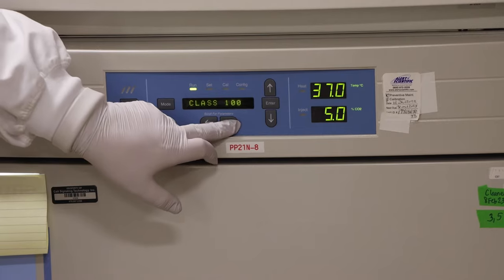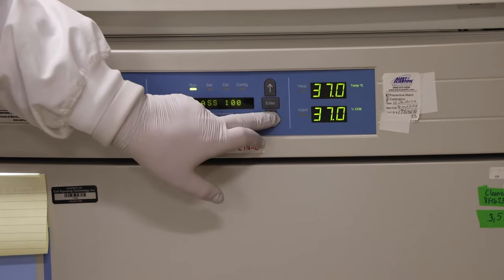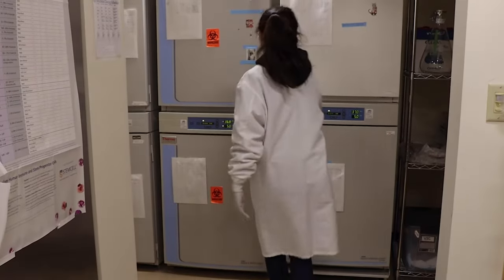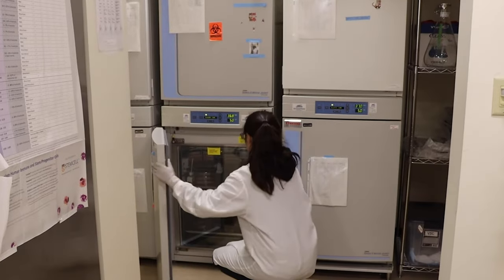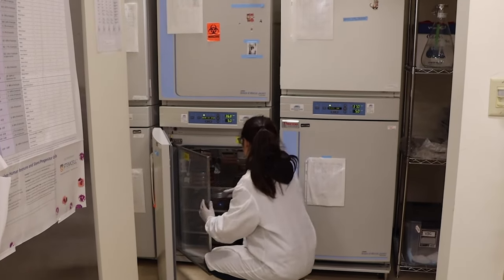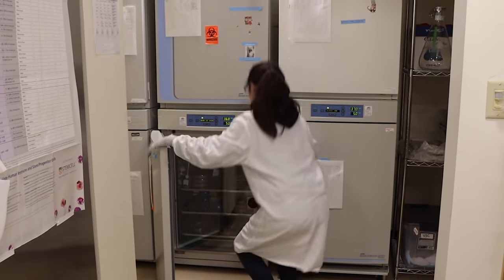Most mammalian cell lines will grow optimally at 37 degrees Celsius. If the incubator is below the optimal temperature, the cells will grow slower. Above 37, the heat shock response can be turned on and cells will be stressed. When receiving a new stock of cells in the lab, take note of any recommendations from the supplier on how often to split the cells and at what ratio.